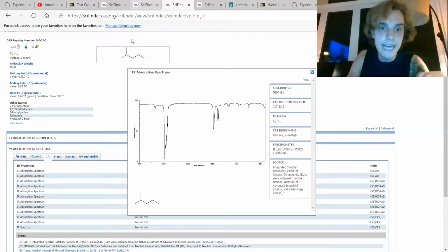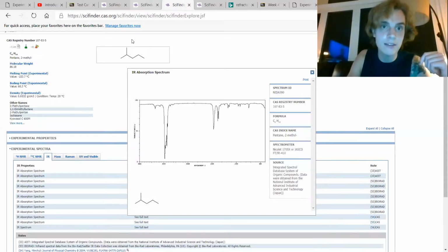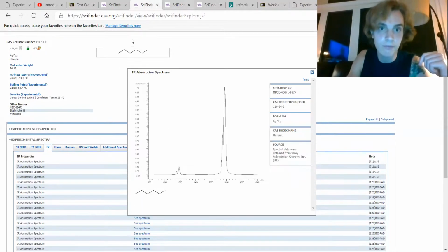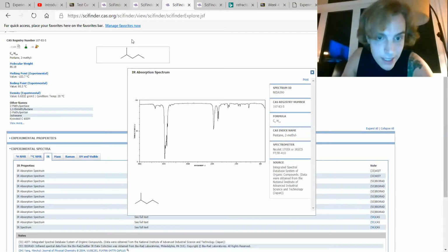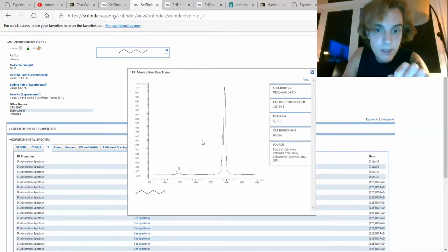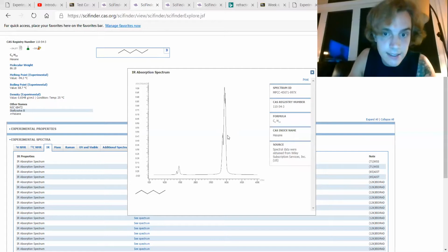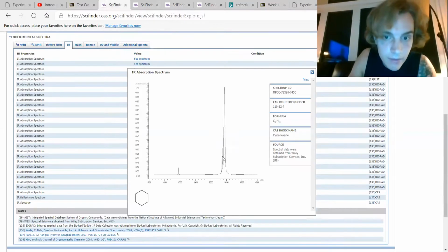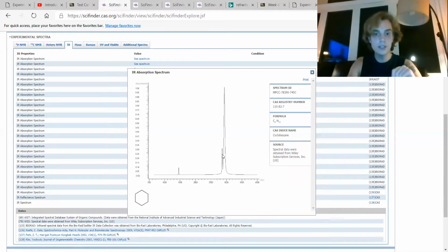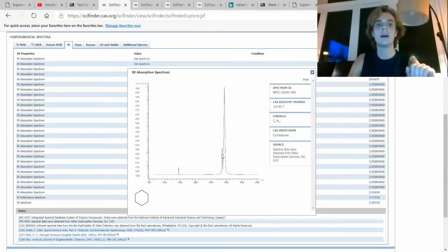I would like to point out that between these two graphs, which I am switching between, they are the same. We see 3,000 here if you follow my mouse, and we see 3,000 here. The difference is this tiny little peak here and this tiny little peak here, which show the smaller residual peak next to the normal one.